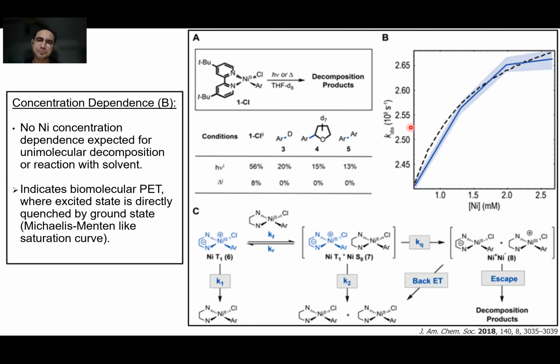And in panel B here, they showed that there is a pretty strong correlation between the rate of the decay of the excited state and the concentration of the nickel. There should be no nickel concentration dependence expected if this was a unimolecular decomposition event.